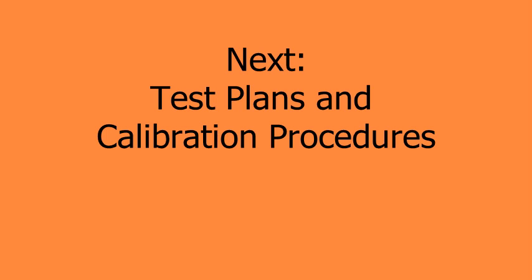So that's it for the first part of the tutorial. Next we're going to look at test plans and calibration procedures that you're going to use in actual pipette calibrations.